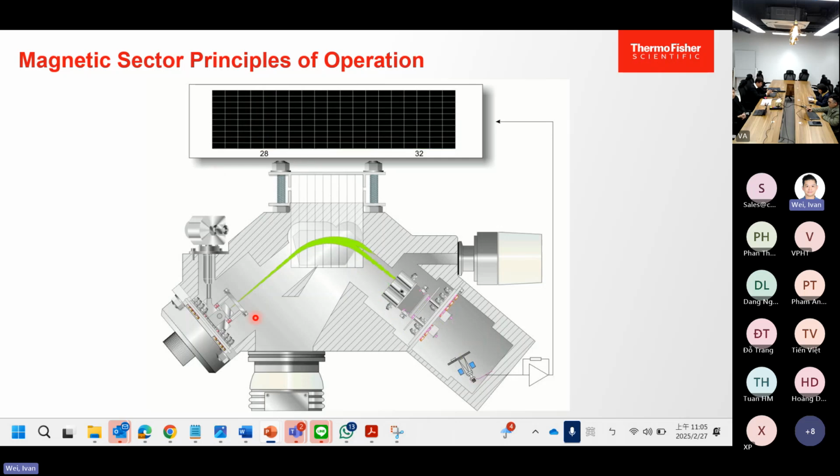As you can see here, once the compound is ionized, it will go through this route, and then the magnetic fields will change the trajectories to make the trajectories hit our ion detectors. So in here, we are measuring nitrogen and oxygen. The mass of nitrogen is 28 atomic mass units. For oxygen, because it's O2, it's 16 plus 16, so it's 32. So that 32 is the oxygen's atomic ion mass.